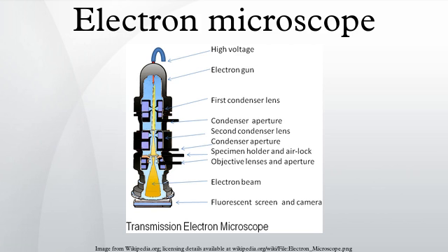In some configurations more information about specimen properties is gathered per pixel, usually by the use of multiple detectors. In SEM, the attributes of topography and material contrast can be obtained by a pair of backscattered electron detectors, and such attributes can be superimposed in a single color image by assigning a different primary color to each attribute. Similarly, a combination of backscattered and secondary electron signals can be assigned to different colors and superimposed on a single color micrograph displaying simultaneously the properties of the specimen.